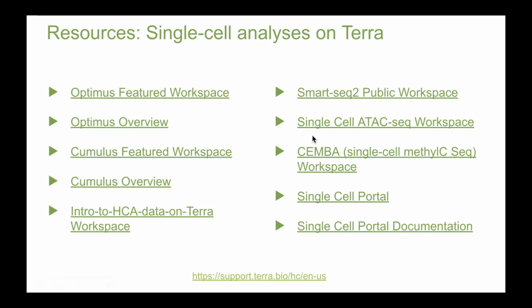We have SmartSeq2 public workspaces, single cell ATAC-seq workspaces, single cell methyl-seq workspaces as well, where you can try different pipelines that are also used by that BICCN whole mouse brain working group for uniform analysis. And lastly, we have links for Single Cell Portal. So if you want to go on and play with some of the studies based on what Leyla showed you today, you can feel free to do that. And we have a link to the Single Cell Portal documentation.